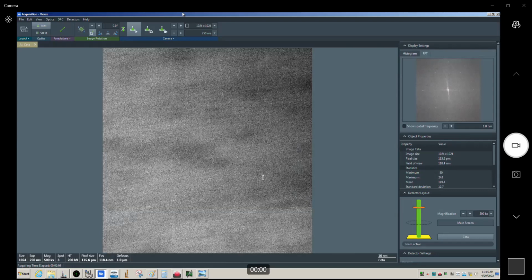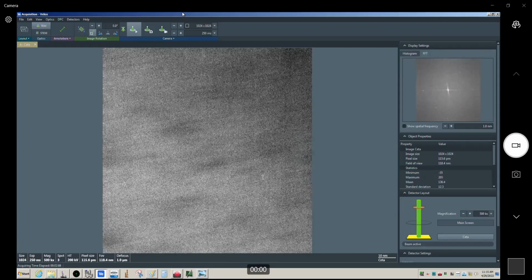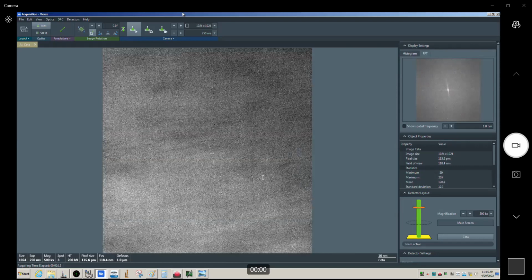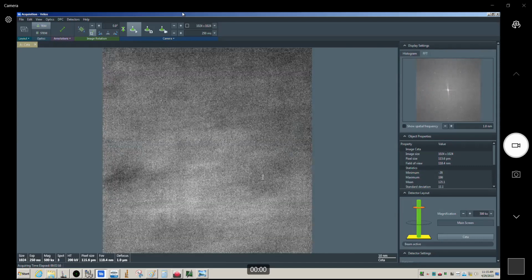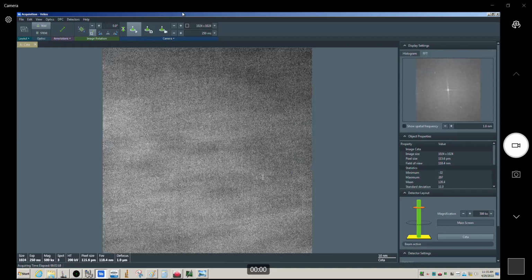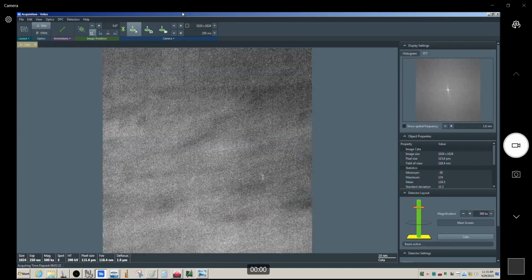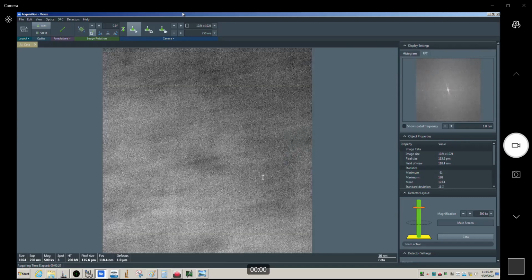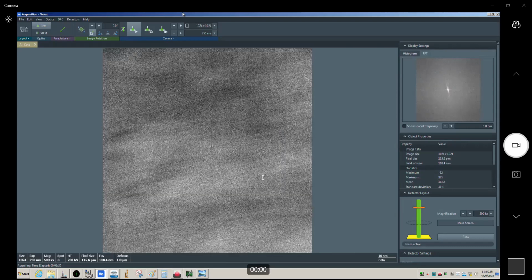But that's the point: if I wanted to correct that, I've got to find something that's amorphous to do it. It's really not possible conveniently to do it otherwise. I suppose if we got really tired of this, we could just put the... because the stage movement is kind of coupled to the mag. So when the mag is really low, okay, I can tell we're getting close though.